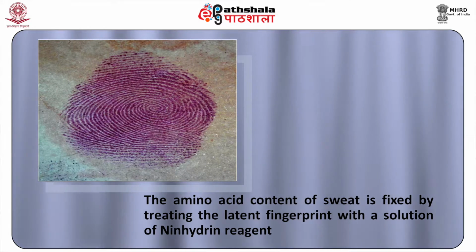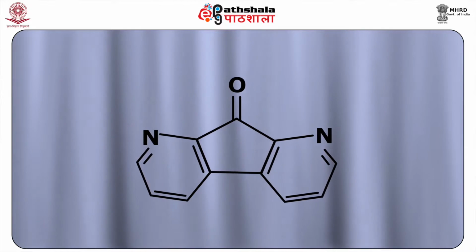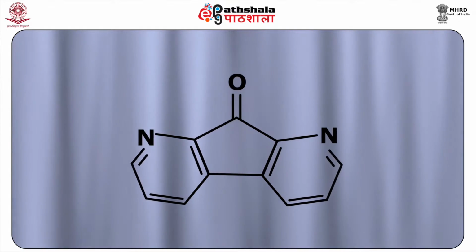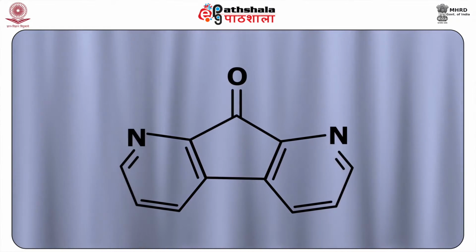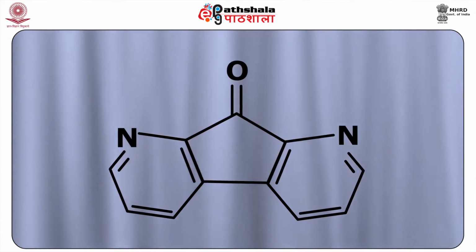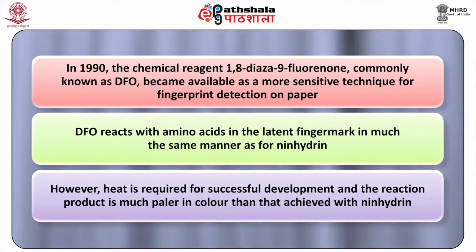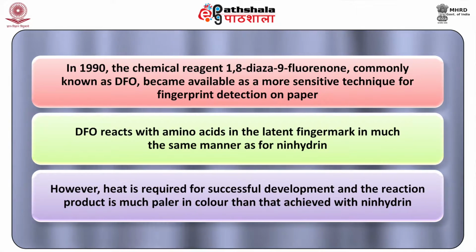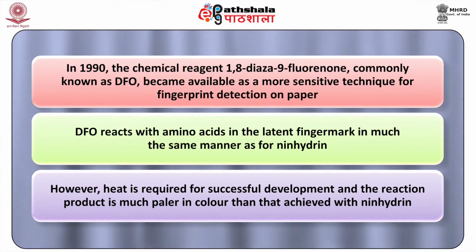The most commonly used is ninhydrin. However, where the latter fails to give prints of optimum quality, other derivatives such as 1,8-diazafluoren-9-one, or DFO, may be called into action. In 1990, the chemical reagent 1,8-diaza-9-fluorenone, commonly known as DFO, became available as a more sensitive technique for fingerprint detection on paper.